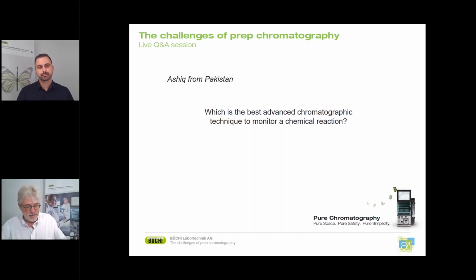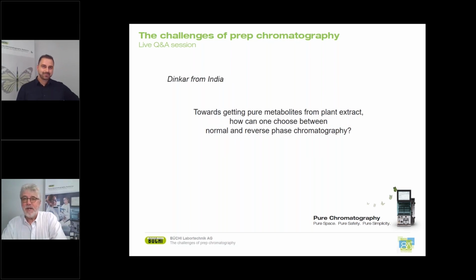Okay, plant extracts, exciting, because usually these are very complicated samples. So I would say it depends again on the chemistry. It's all about the identity of the compounds and how the extract is done.